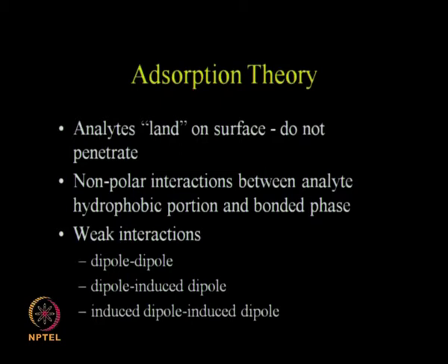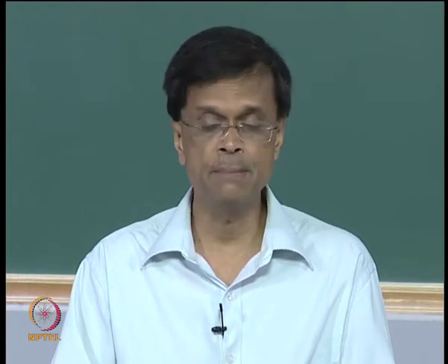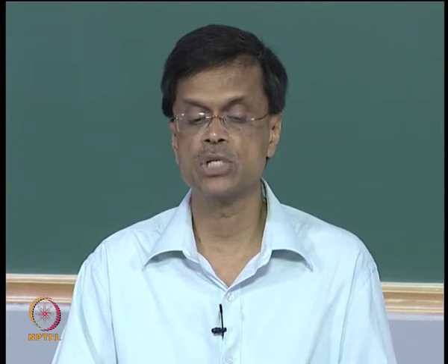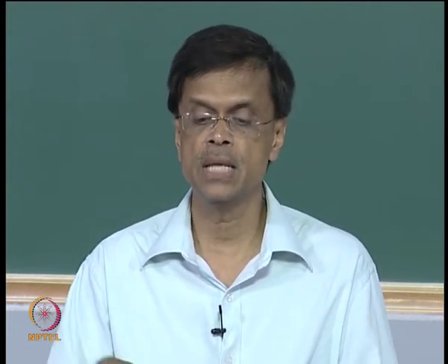So you see three different theories. One talks about how the analyte affects the solvent that is present, and the stationary phase does not come into the picture. The second theory is partition, that means the liquid in the stationary phase and the solute in the mobile phase partition based on log P. The third theory is adsorption, where the analyte lands because of non-polar, hydrophobic interactions between the analyte's hydrophobic region and the bonded phase.